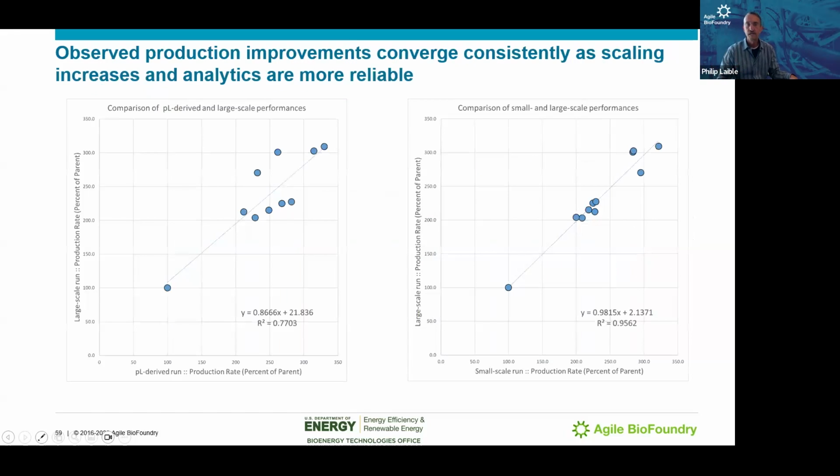Next couple of slides go over possibilities of using it more in the future, but one last slide on just how our analytics are very important to make sure you have high quality analytics to go along with this, because your confidence in learning about their enhancements is greatly improved if you take a couple extra steps and evaluate them additionally, besides our first picoliter evaluations, before you do scaling experiments. But all you see here is that the error gets tighter as your confidence improves.